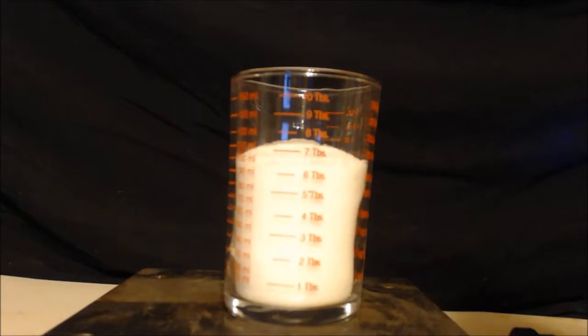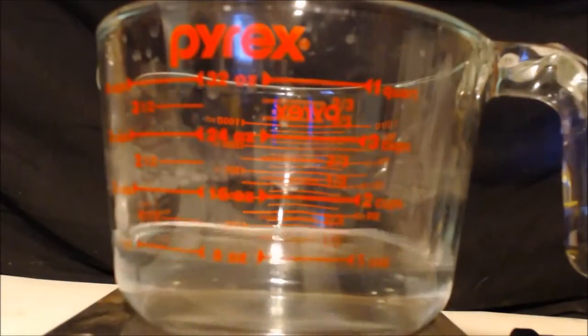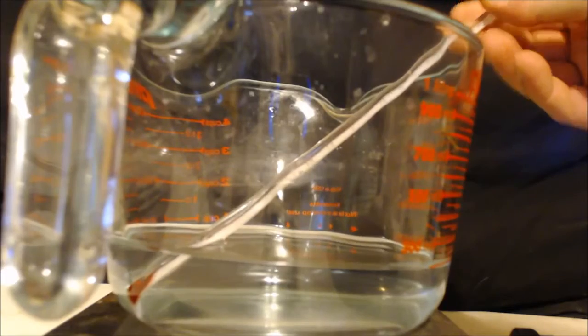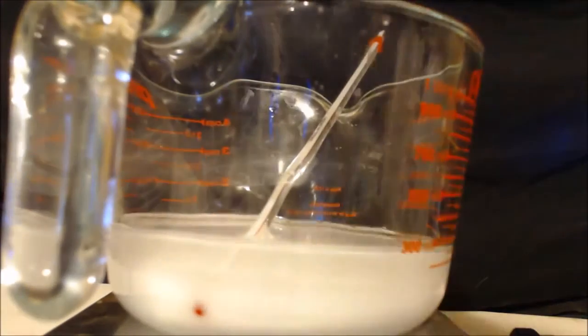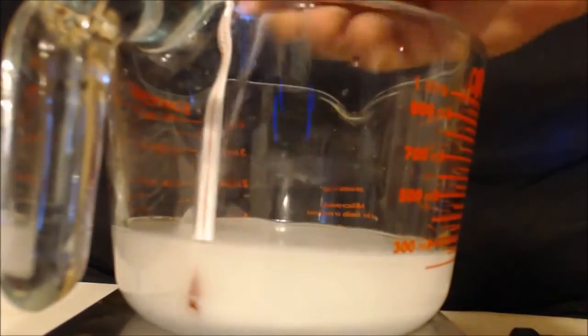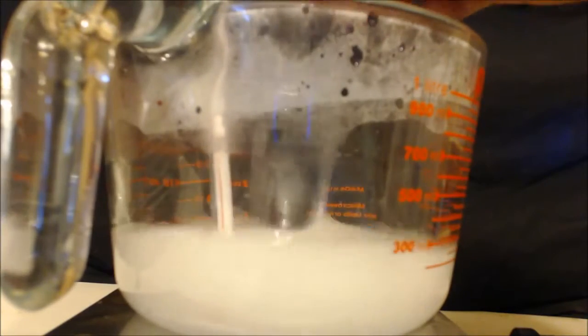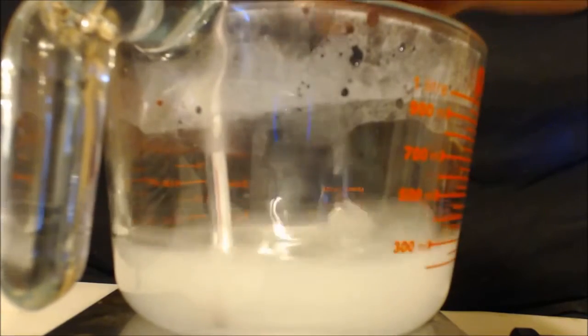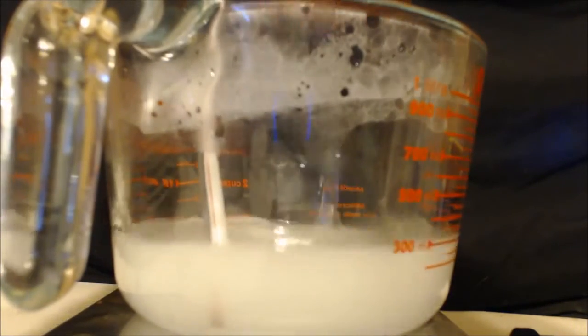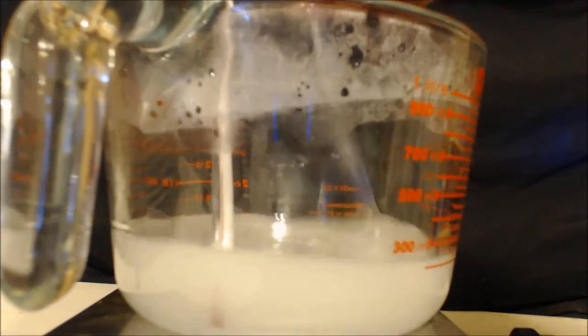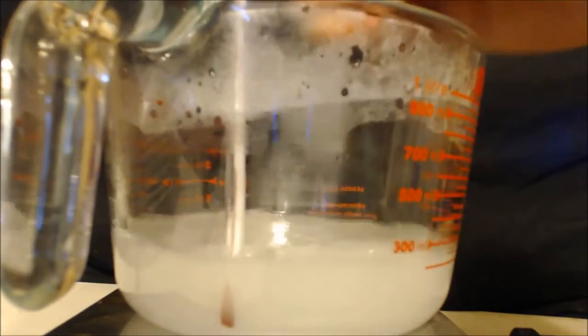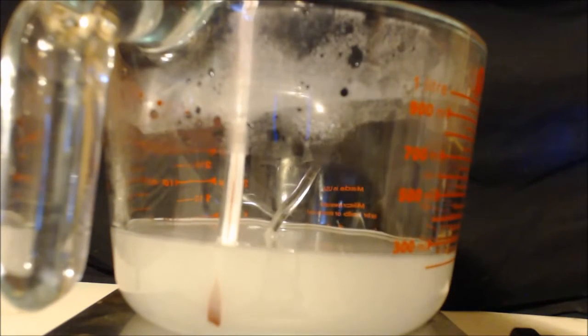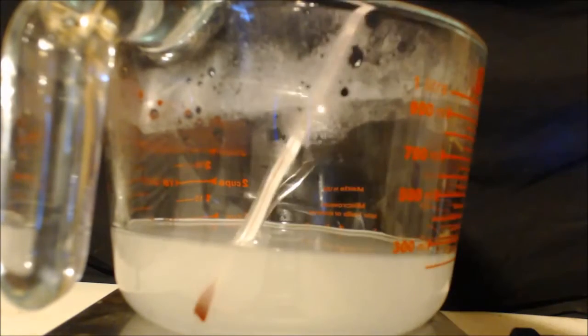All right, there's 120 grams of sodium hydroxide. Got an arbitrary amount of water there, starting out about 22 degrees Celsius. I'll dump it all in at once. 80, 85, 90. Can we get it to boil? 95. Close, 95. Now it's starting to go down.